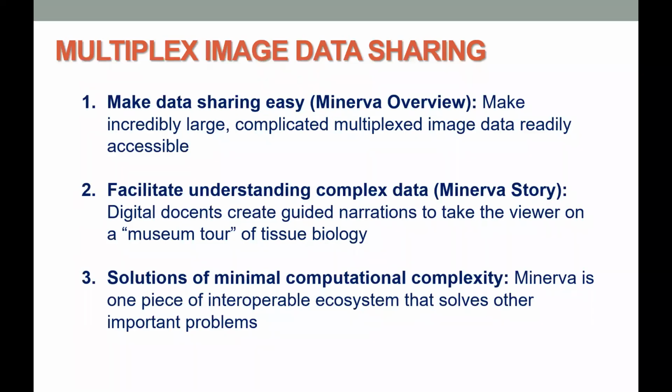But with that image, each of our images is probably over several hundred gigabytes in general. So sharing these images is also not so easy, or even just having the ability to open them. We want to make sharing and visualization much easier, and we want people to be able to use this image sharing tool to understand complex data.